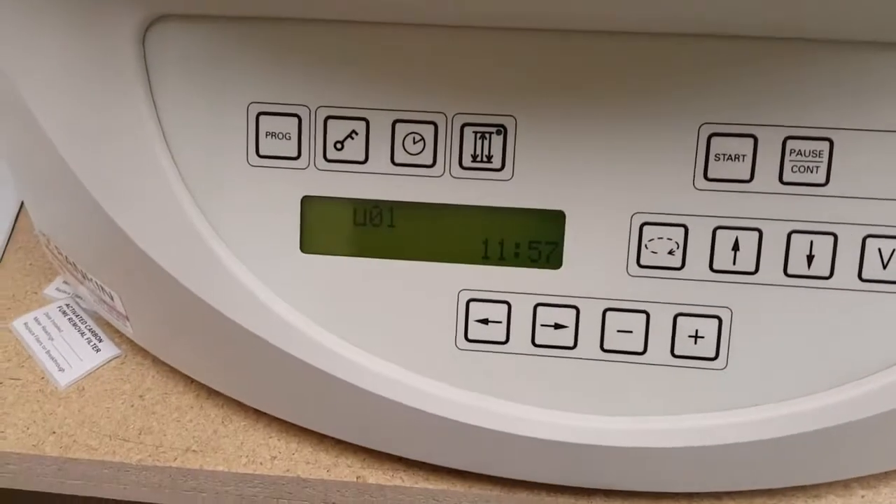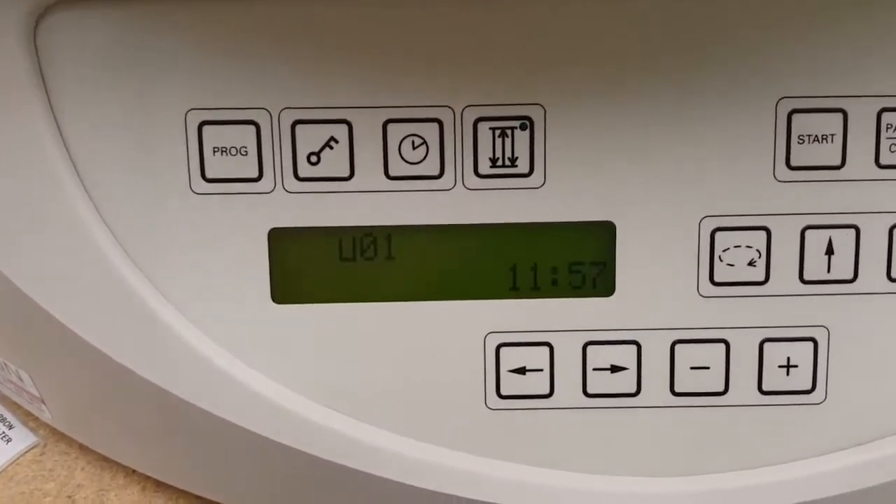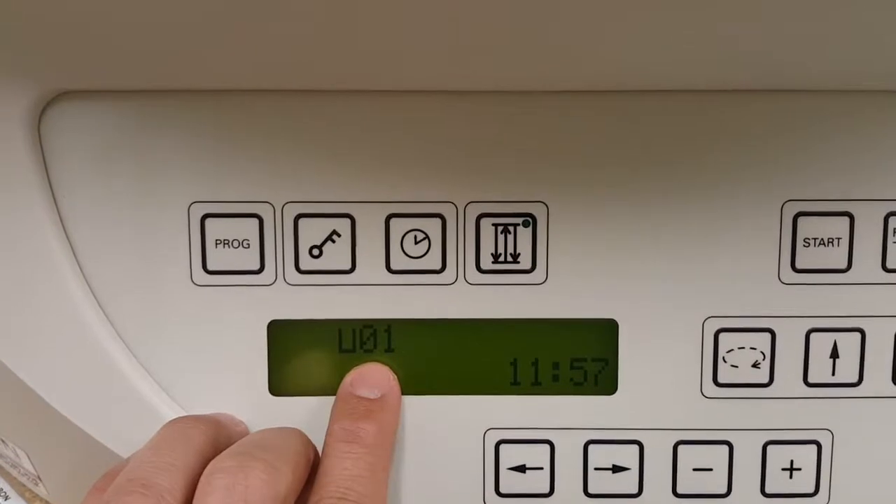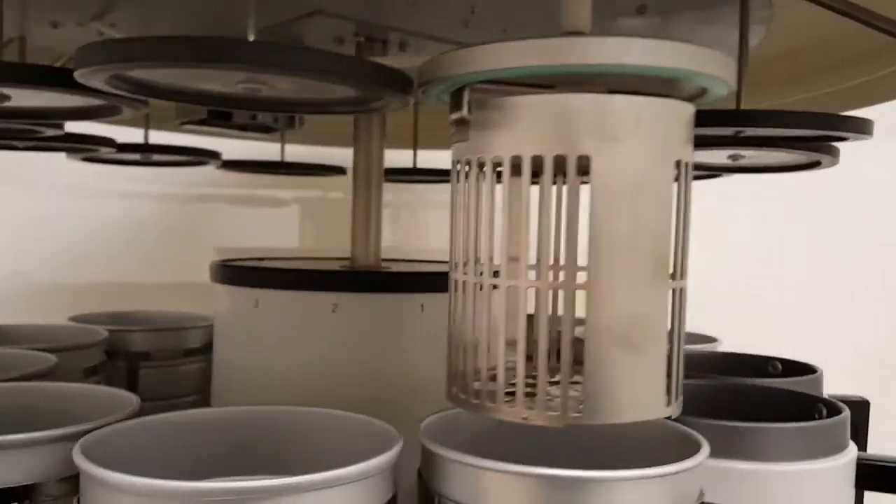This is the Leica TP-1020. This is the standby display. It displays that you are in Station 1, and it is in Station 1.